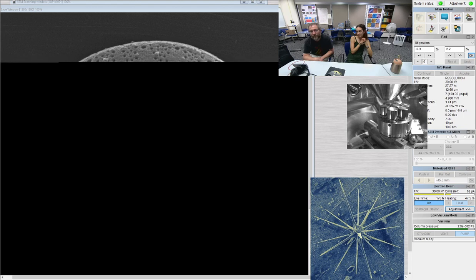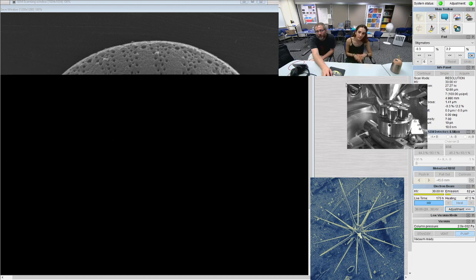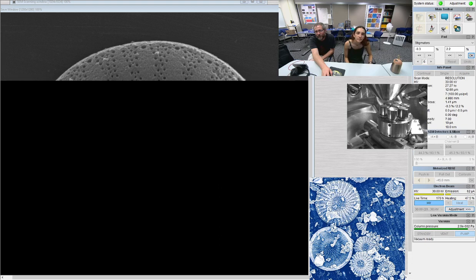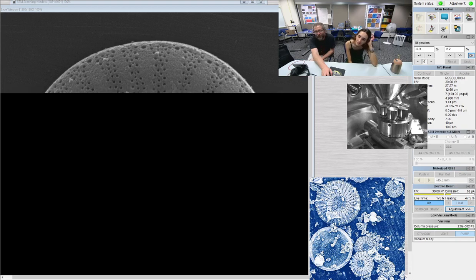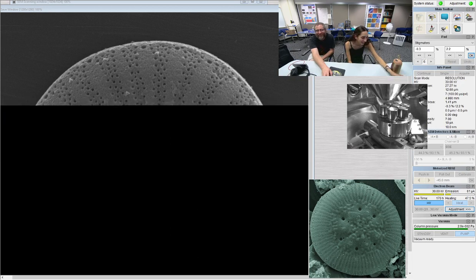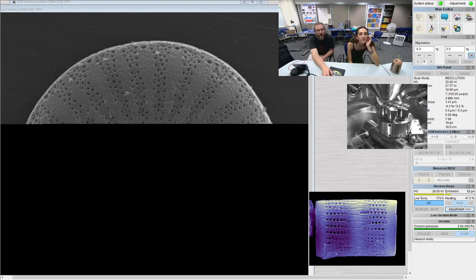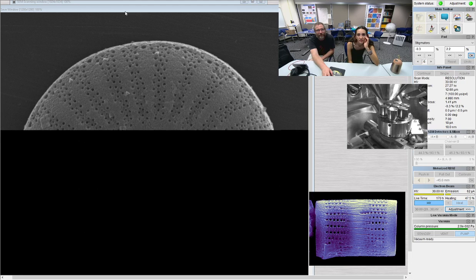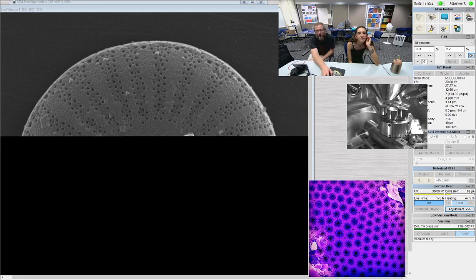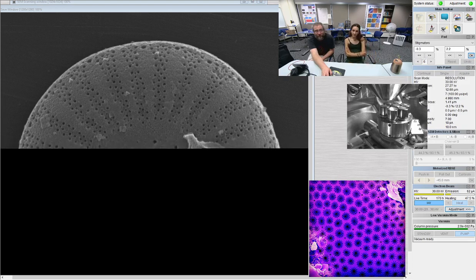And the problem is, it takes 3 minutes to collect an image right here at 1280 by 1280. If I take it up to 16,384 by 16,384, it'll take almost 8 hours to take one image. And I don't want to wait that long. No one has that kind of time. It's a whole day's worth of work, a whole day of it collecting one image. But that is the maximum resolution we can get. We're at the current maximum live resolution that it can produce, which is 1024 by 1024 for the live image. But for picture taking, it can go on forever. I mean, a 16,000 by 16,000 resolution image is monstrous in size.